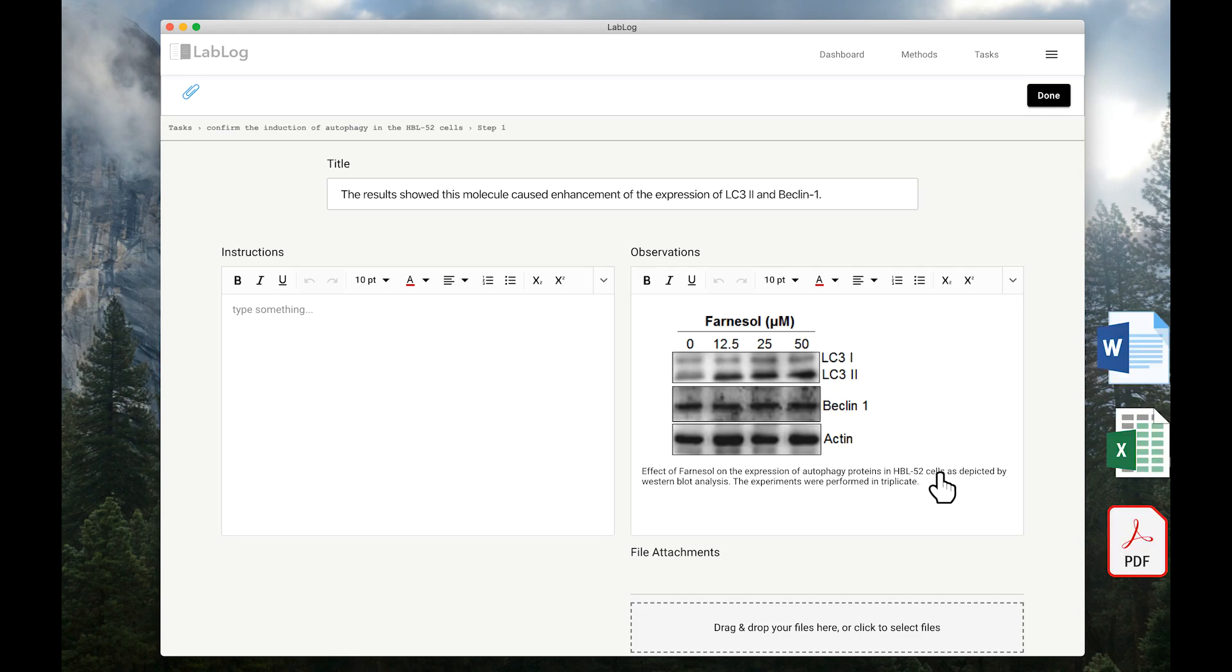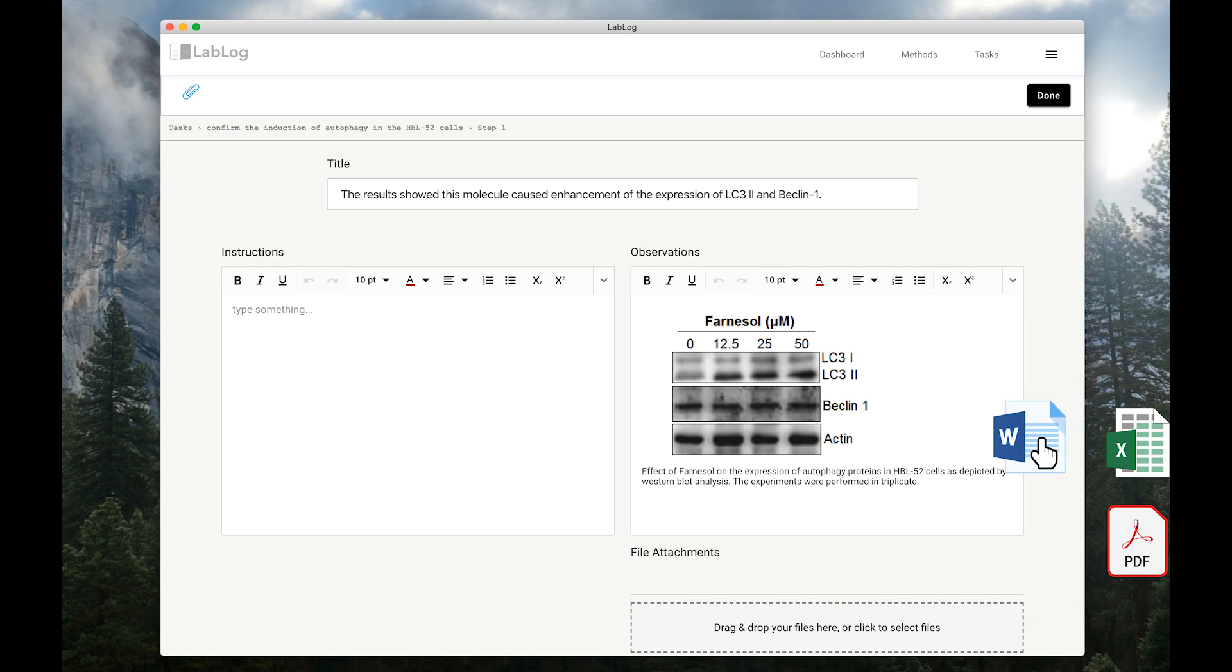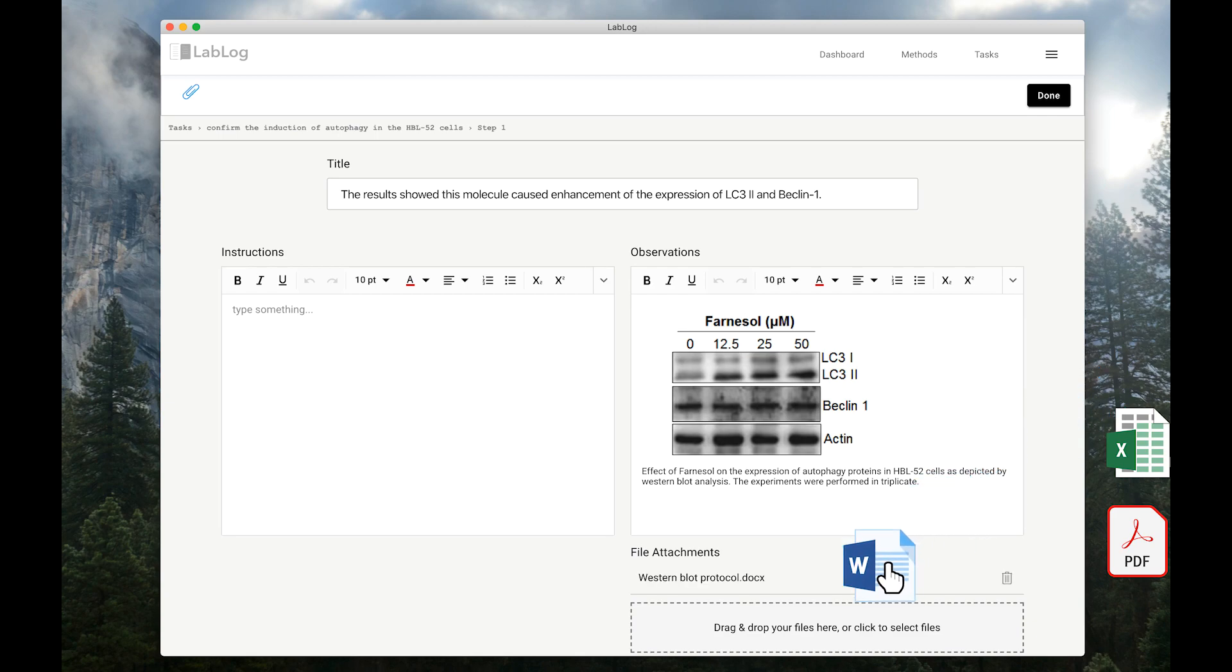Look, I got them right here. Just simply drag and drop them into the right note, like that. You can preview images, spreadsheets, and Word documents.